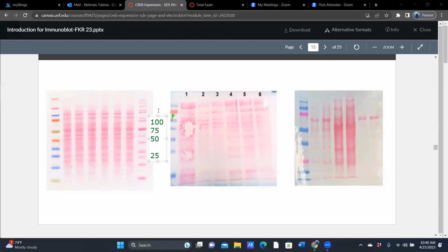Similarly, if I was looking at a protein up here where the red one is, where there is no bubble, I can use it. Or anything underneath, I can use it. But if my favorite protein fell with the bubbles, then I can't. So that's something to be aware of.